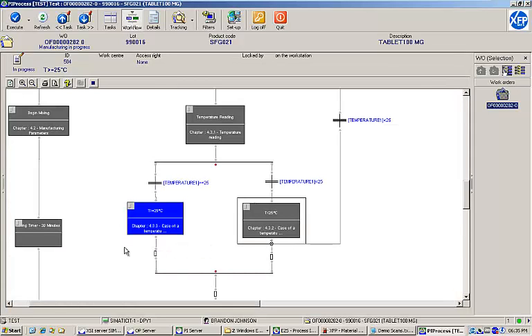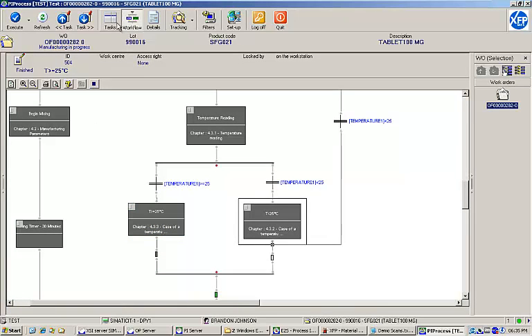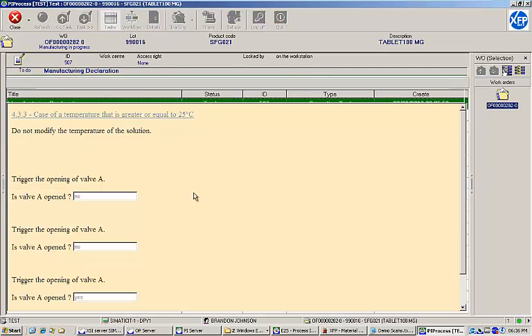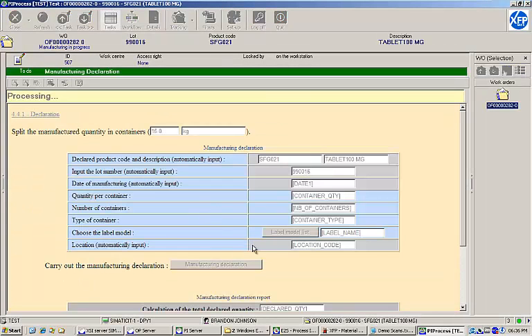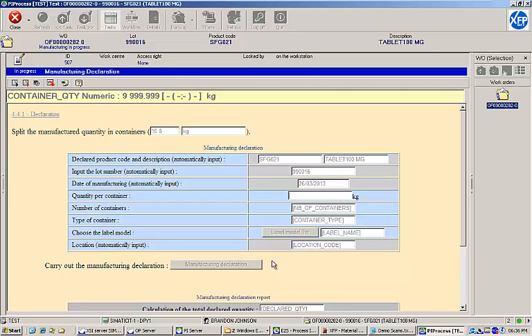Now that our solution has mixed for the required amount of time and we've performed our temperature adjustment, it's time to execute a manufacturing declaration. This process instruction asks us to input the quantity per finished goods container and the number of containers that were produced. We'll say we produced three containers at five kilograms a piece.